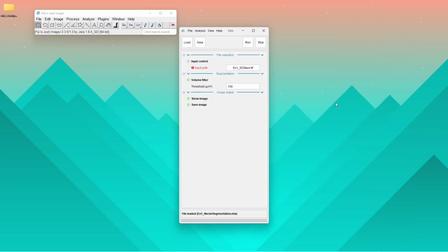The intention here is that the visible parameters in Processing View are only those that need to be configured on a run-by-run basis, so cover options such as the files or folders to process, optional filters, and visualization settings. In this instance, there's a file selector, and you can see that this is currently listed in red, and if I hover over this, it will show us the path to the image that it's trying to load, and that doesn't match up with our current path. So if it's showing up in red, it means that it can't find that current file.